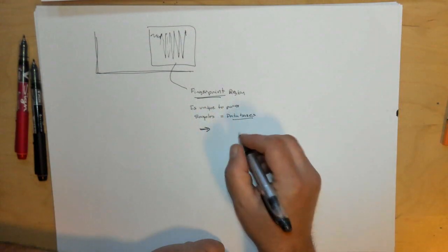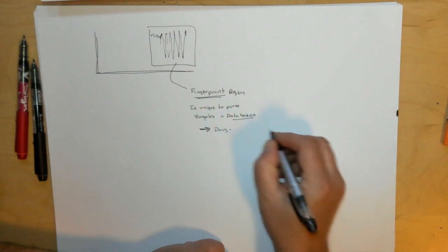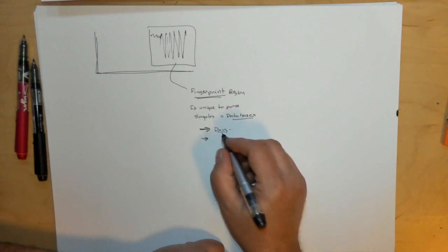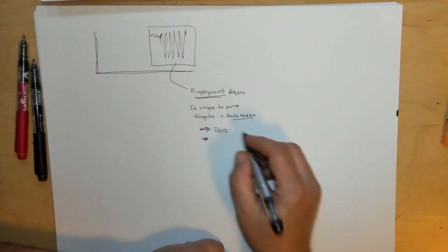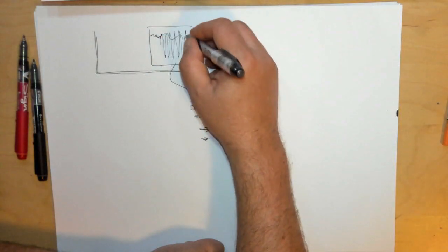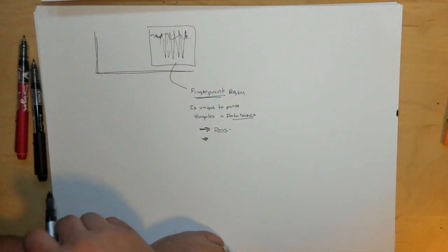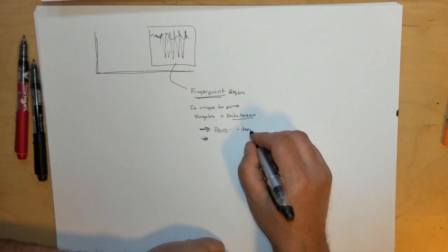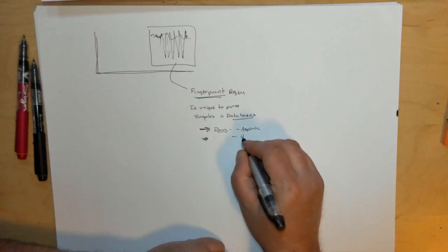So for example, if it's some sort of drug or a well-known medicine or something like that. I mean, this could be an illegal drug or it could be another medicine. The machine will be tied to a database and it'll tell you right away, okay, this is aspirin, or heroin for that matter.